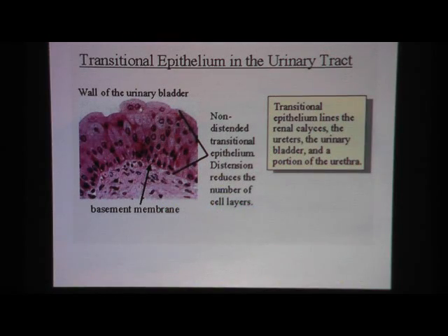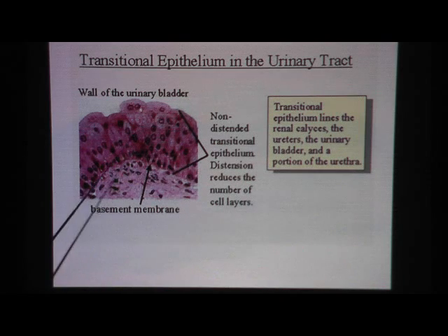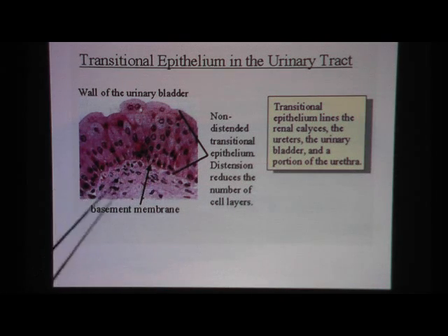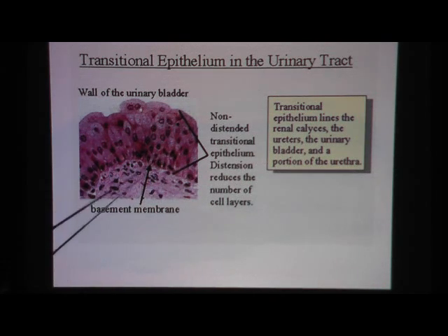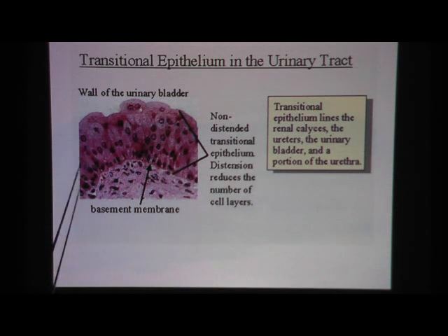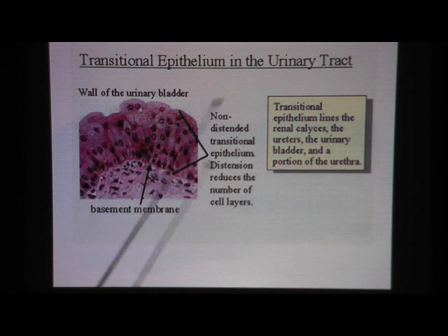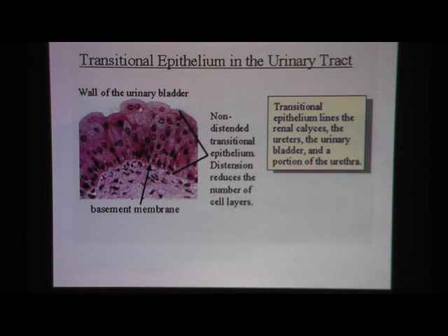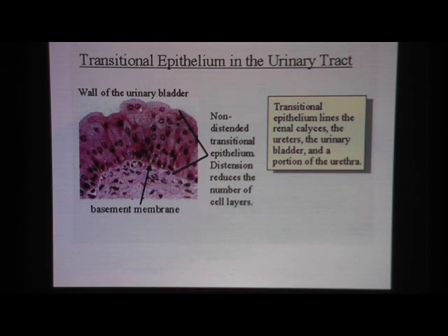Transitional epithelium — here we see it in this picture, similar to what we saw before. The whole thing is transitional epithelium, and keep in mind the shape of these cells varies. It's never the same shape over and over again like the other epithelial tissues we have seen.